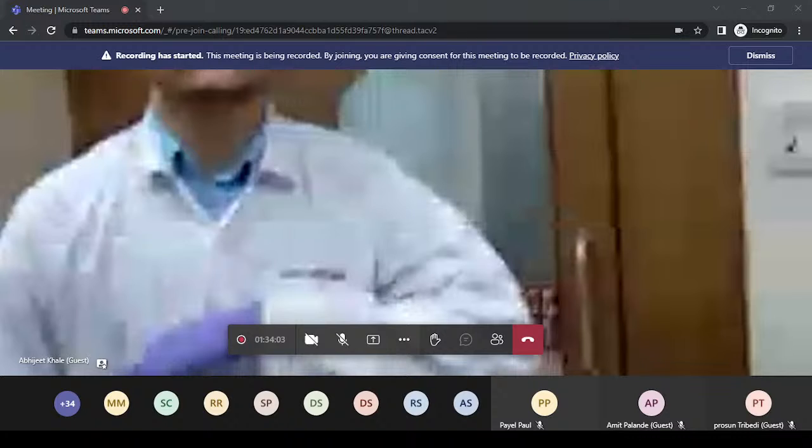After selection of a suitable stationary phase, we need to apply the samples and standards, which are in liquid form, onto the plate by using HPTLC applicators. So this is a CAMAG ATS4 automatic TLC sampler, an HPTLC applicator. Here we can keep 66 samples or standards at a time in the vial rack. There is an autosampler tray and a Hamilton syringe inside, 25 microliters or 100 microliters. We can apply 1 microliter to 100 microliters onto the plate as per our need.